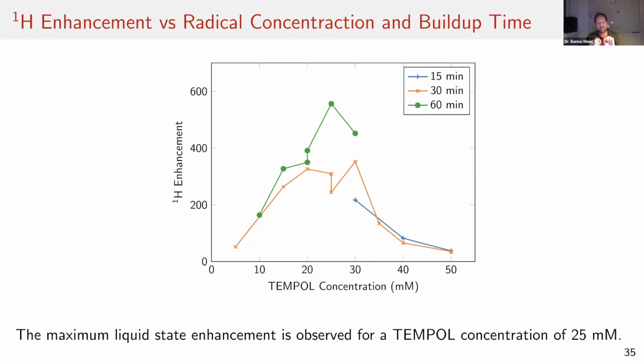When we saw that, we decided we don't do this anymore, because your sample contaminates your entire system, and very quickly you need to warm up everything, clean it and do it again. So these ideas to move the bullet with the liquid and freeze it only later, they really never worked. So we're not looking back to that.